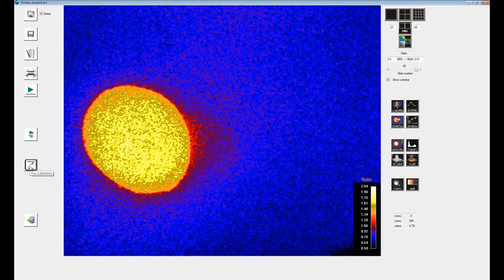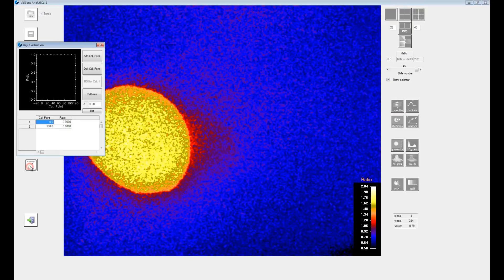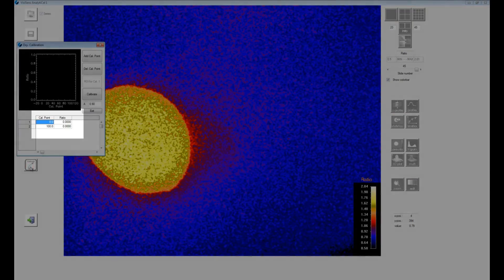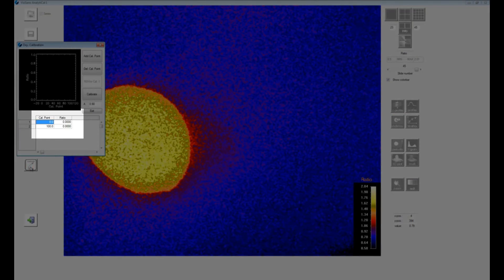Click on the calibrate button. In the table in the lower half of the dialog two rows with the zero calibration point and 100 calibration point are already shown.